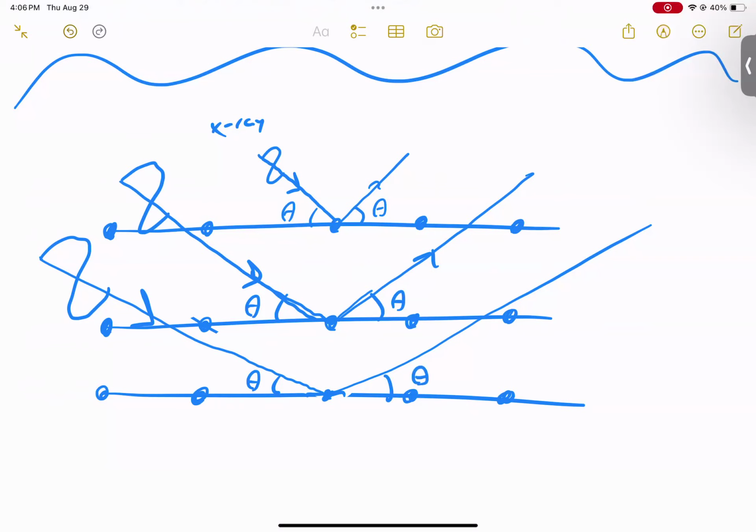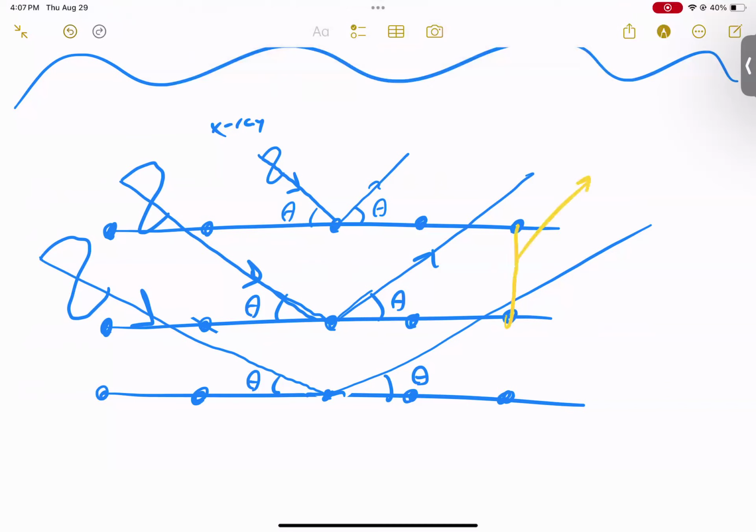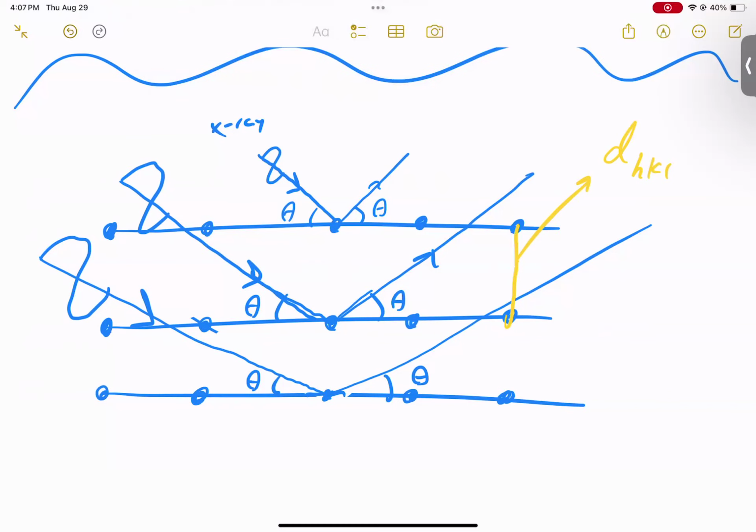All right, so then once we shoot an X-ray onto a crystal structure within the planes, we're going to have specular reflections across the different planes. And I guess I should also specify in yellow that this refers to atomic distance or atomic separation. So d_hkl, hkl refers to the plane. And this is the part where diffraction actually starts to come in, or I guess wave interaction. Because what happens here is that the machine or sensor then detects these waves going into it, and they were able to get results from there.